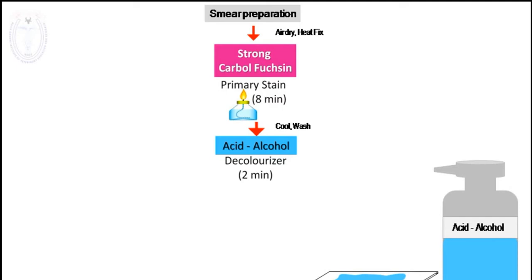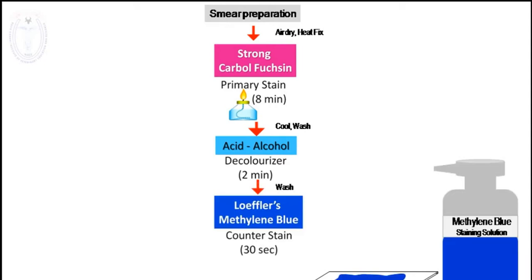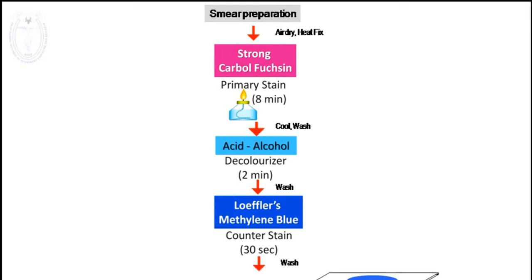Lastly, add the counter stain, the Leffler's methylene blue staining solution, over the smear. Allow it to stand for 30 seconds to 1 minute. After 30 seconds to 1 minute, wash it with the distilled water. After washing, blot dry the smear using the blotting paper. Now, the stained smear is ready for the microscopic examination.